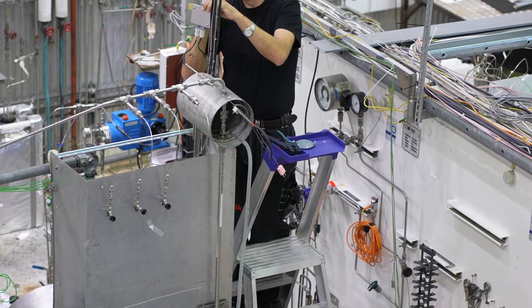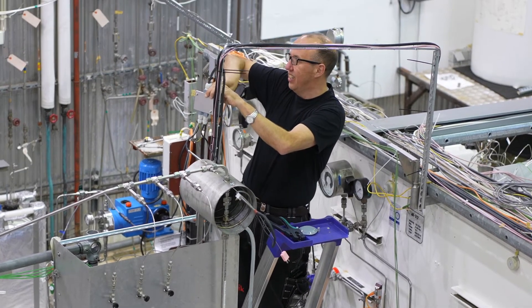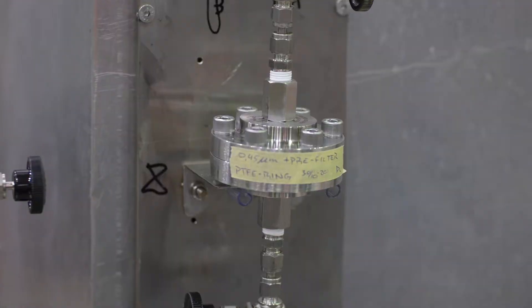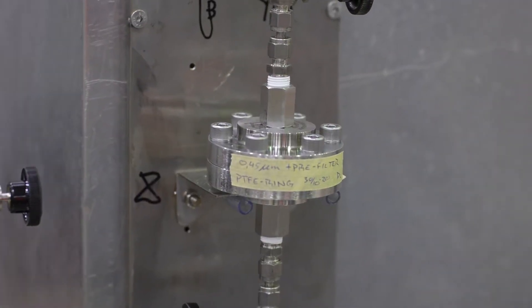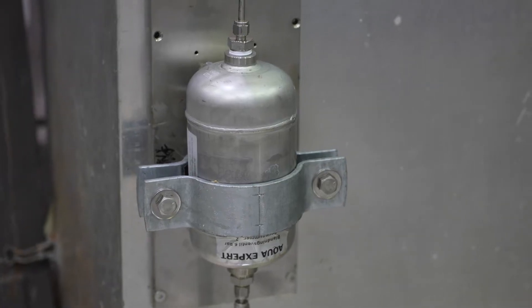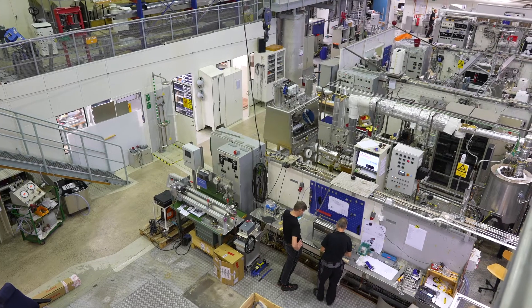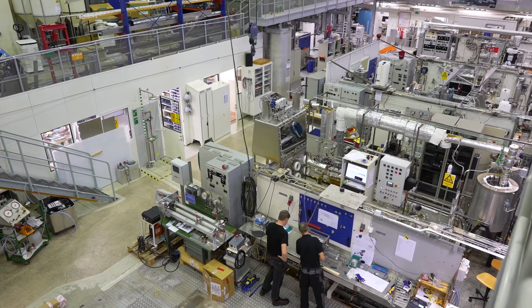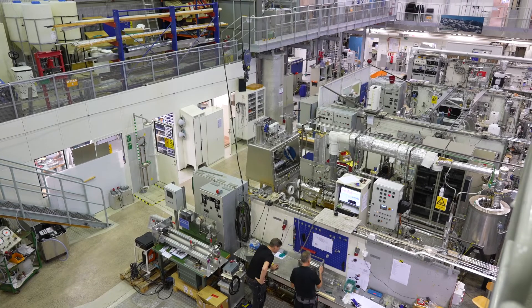Various corrosion, material integrity, and water chemistry issues related to nuclear power plants are studied. For example, initiation and growth of stress corrosion cracking, activity buildup, and CRUD-induced power shift from various water chemistry effects are studied in the laboratory.